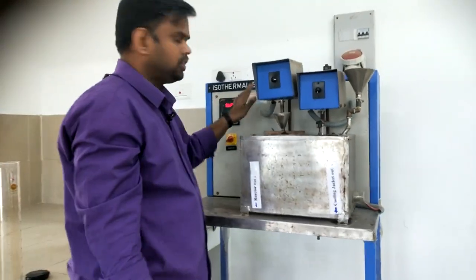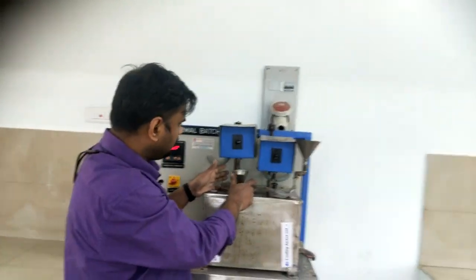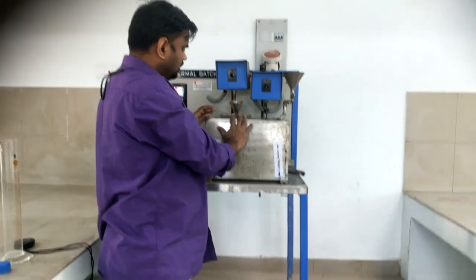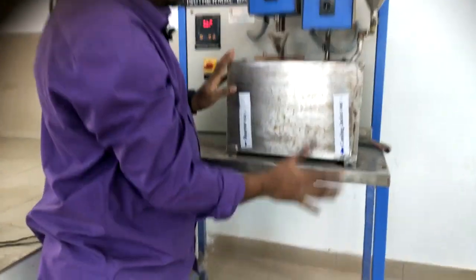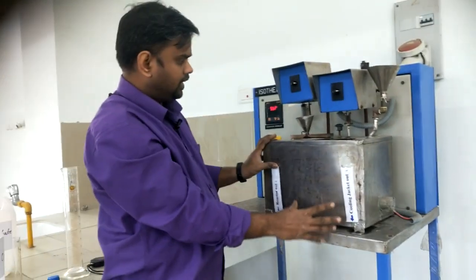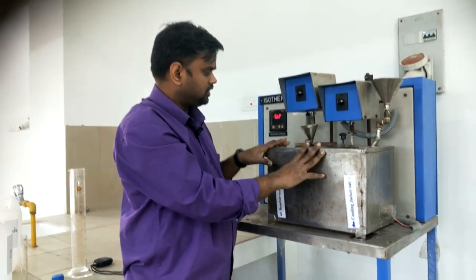So what is this setup? This is an isothermal batch reactor, a simple batch reactor with an adjustable agitator. We adjust the speed using this. And we have a cooling jacket where we have inlet water and outlet water. We use another agitator to maintain a uniform temperature in the cooling jacket. That way we are maintaining isothermal conditions in this reactor.